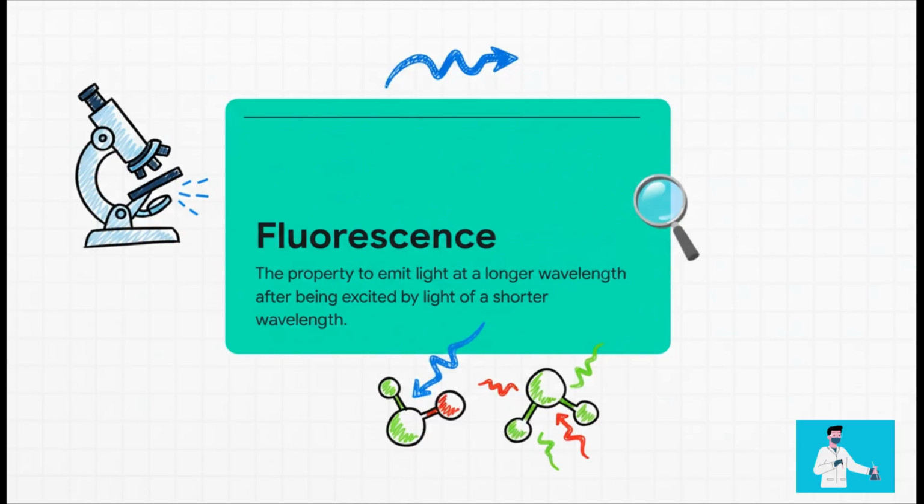Okay, now let's talk about making things glow in the dark, because that's basically the essence of fluorescence. Certain molecules, called fluorochromes, have this amazing property. You hit them with high-energy light, say blue light, and they absorb it, and then they spit that energy back out as a different color, like green or red.